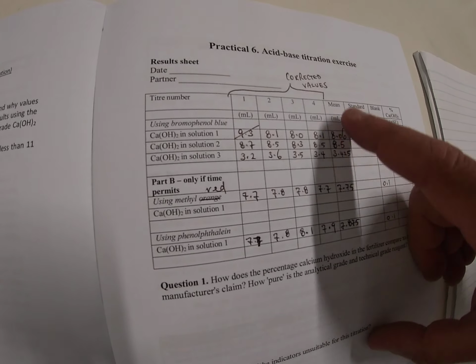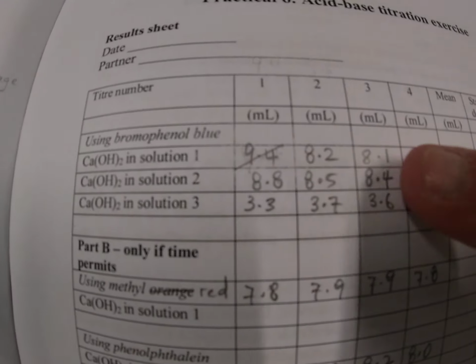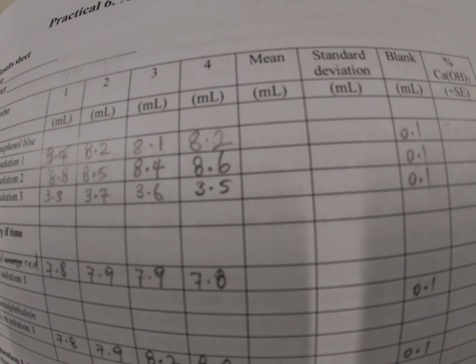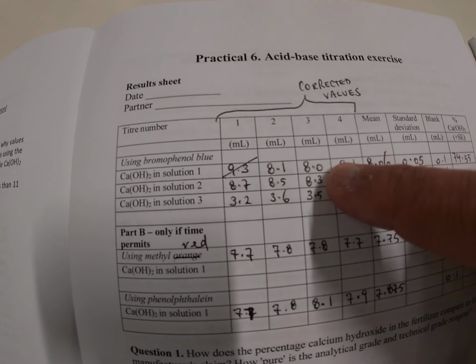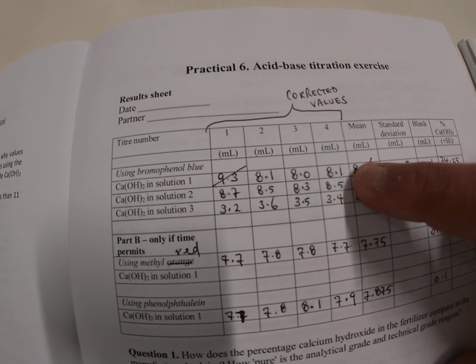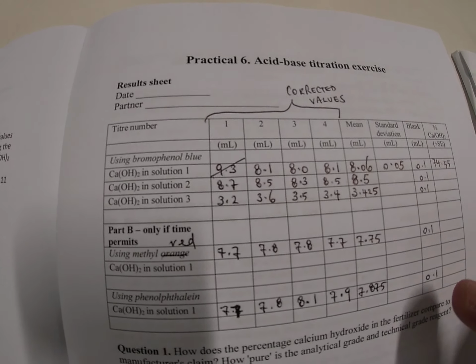Sorry, before I go on to the mean, I've done the corrected values. The corrected value is our initial titer, in this case 8.2, subtract the blank, which is 0.1 of a mil. So 8.2 now becomes 8.1. 8.1, our initial value, now becomes 8.0. And our final value, which was 8.2 minus the blank, is 8.1. So these are now corrected values.